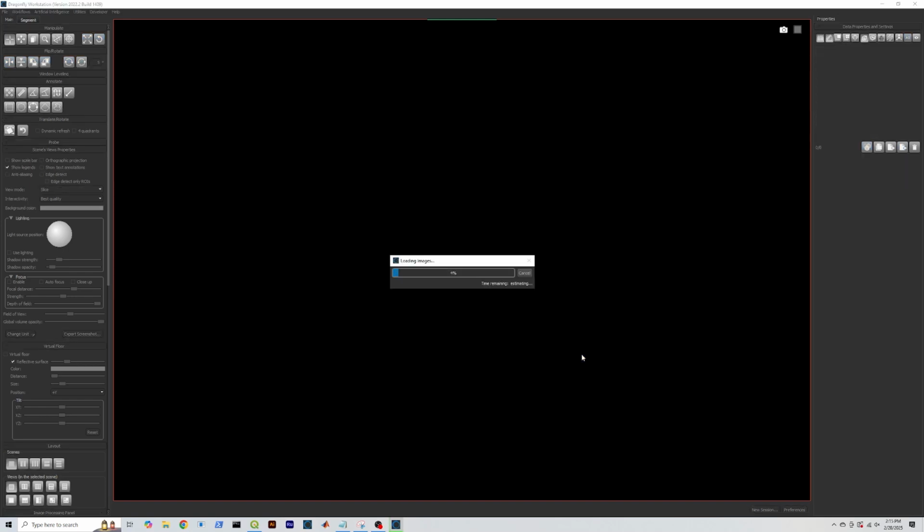This can take up to 10 minutes. But apparently it's going faster, which is awesome.